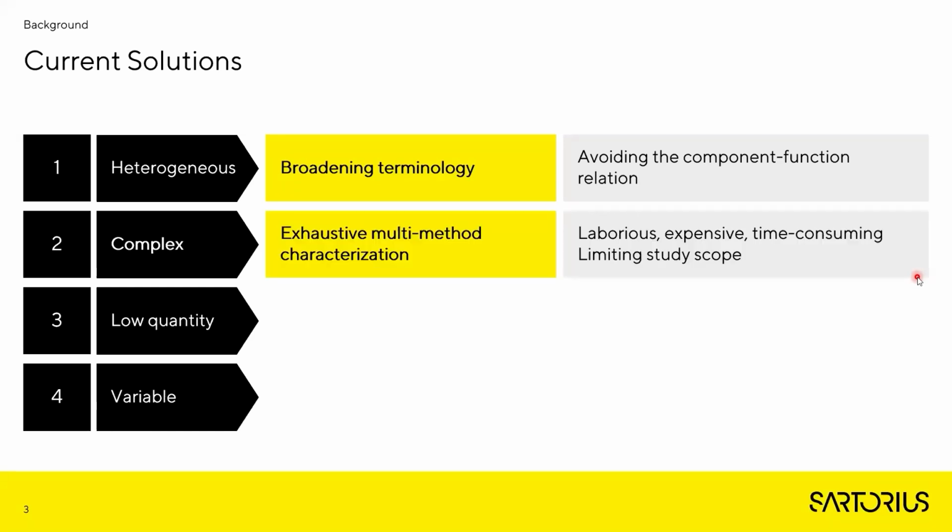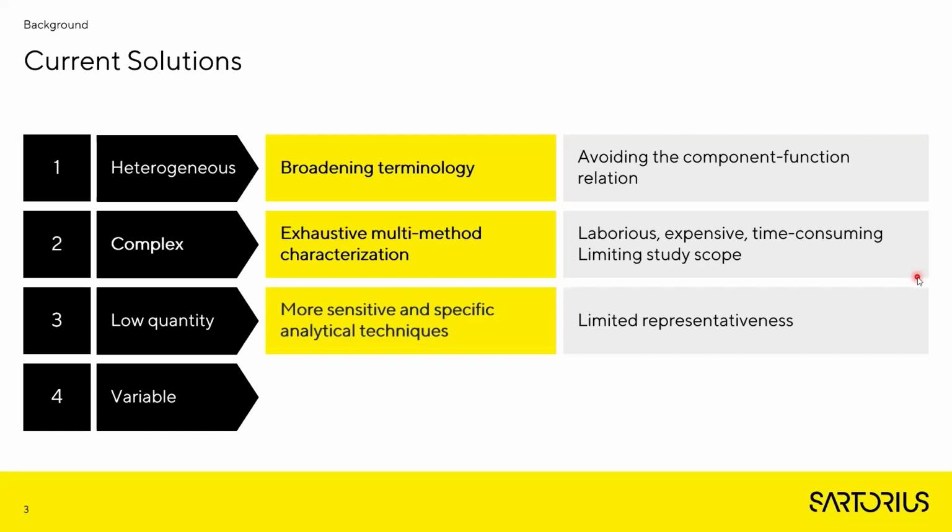To address the complexity of the preparations, the field compiled guidelines, which basically suggest to analyze the samples with as many methods as possible. This often means a lot of work, high costs, time-consuming analysis, and all this together often limits the study scope. Nevertheless, there is rarely enough of the samples to perform everything that we want to perform. So nowadays, we have many more sensitive and specific analytical techniques.